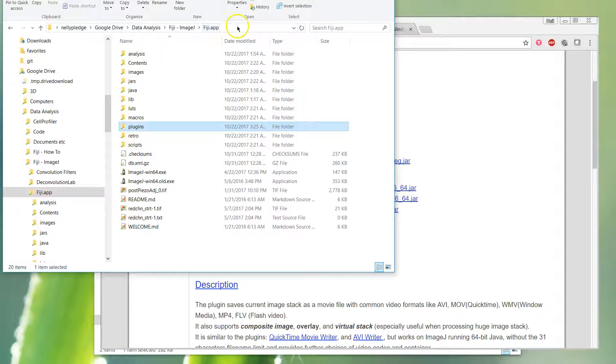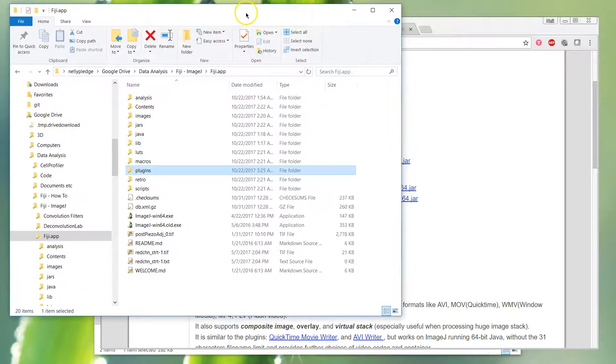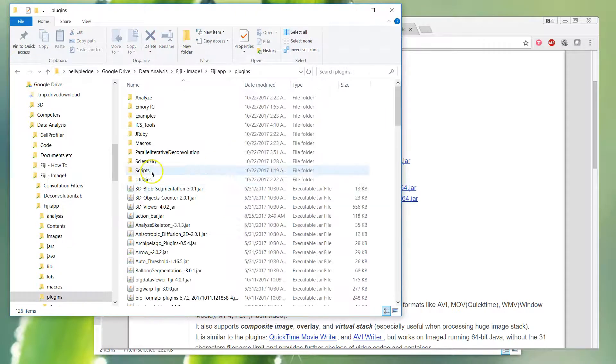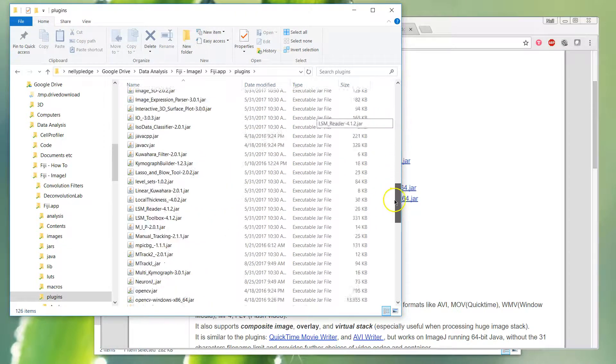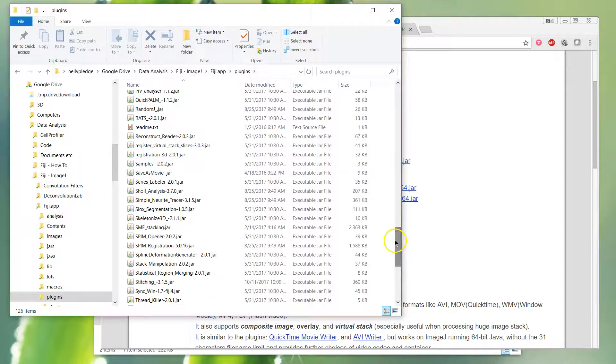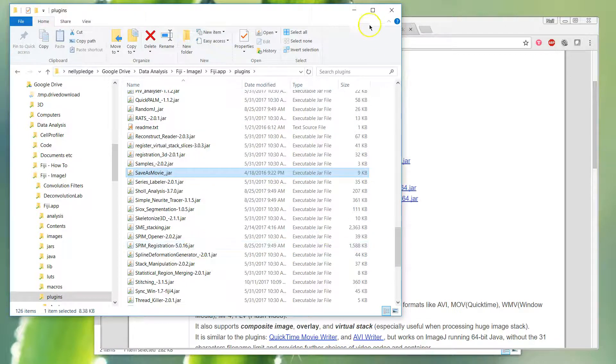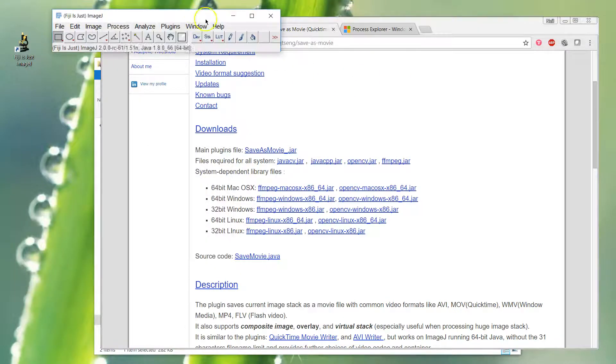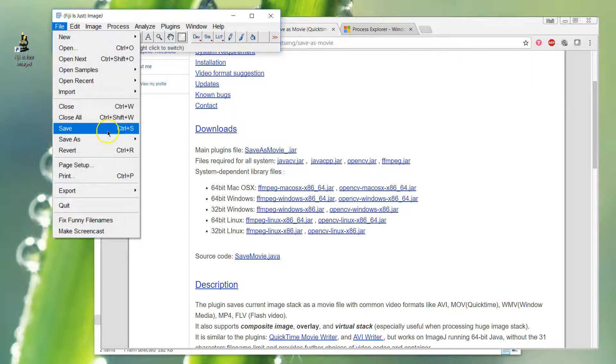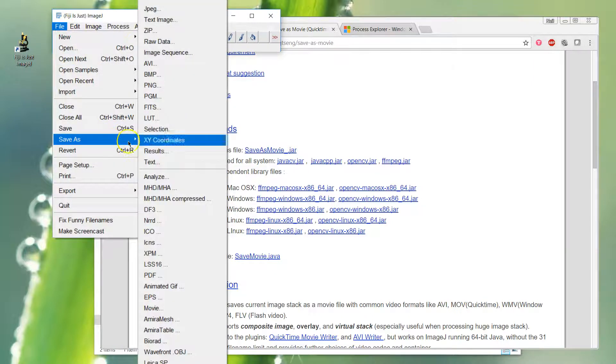Once you've downloaded those, you have to put them into your plugins folder. Find your Fiji app where you've opened it, unzipped it, wherever it lives. I keep mine on Google Drive and sync it across different machines. Once you go into that plugins folder, you just drop it in here. Once you've put them in place, you open up Fiji and you'll see a File > Save As > Movie option here.